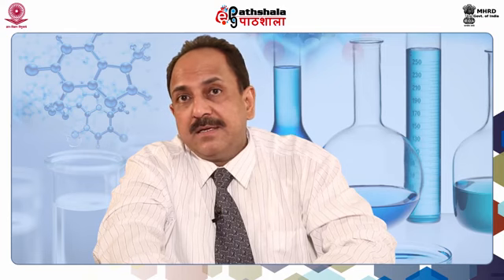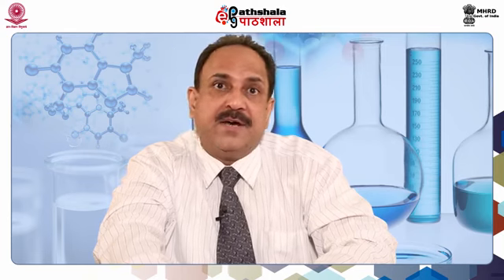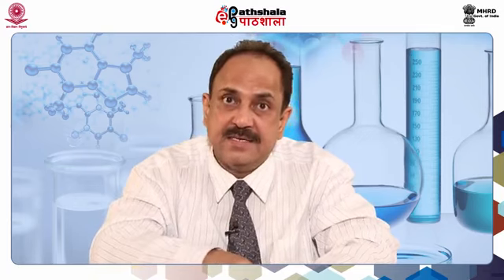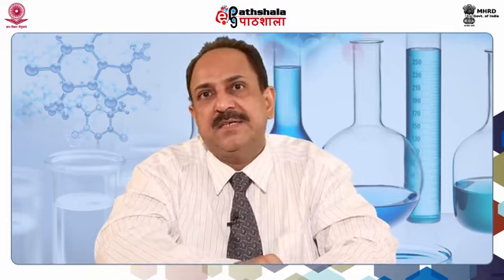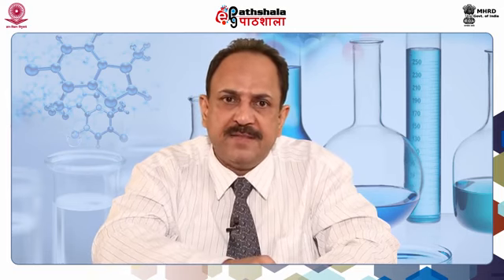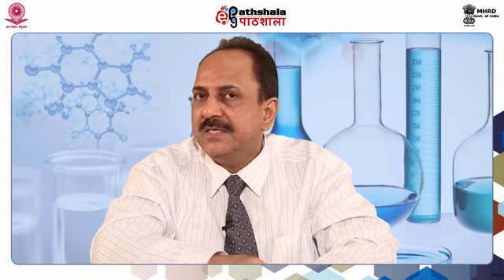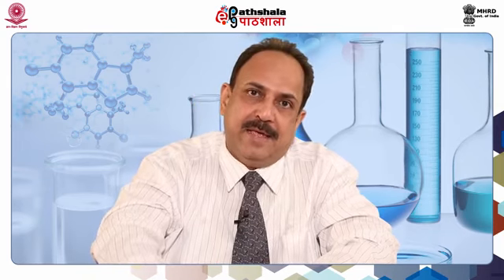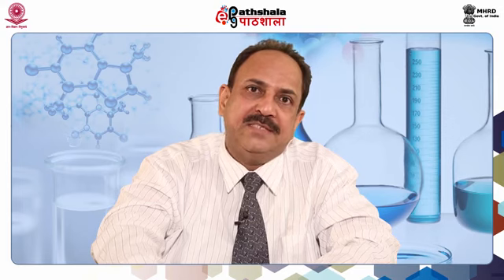We can use an online browser containing an applet for analysis of the three-dimensional structure of the protein molecule or the enzyme molecule, or we can have better analysis with a standalone application installed on your local computer. As we have seen in the previous module, we used JSmol and Cn3D online applications for visualizing the enzyme active site for the OSBS.